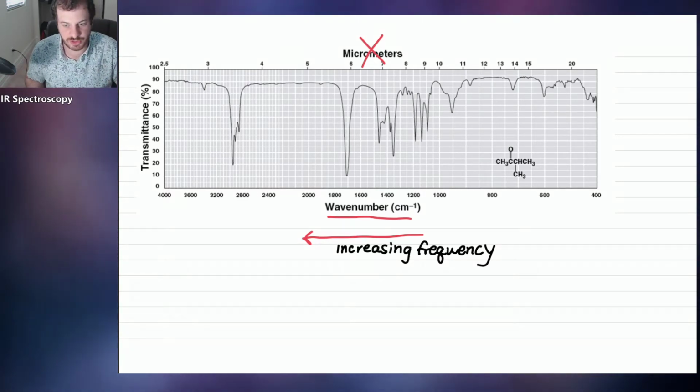Well, before we talk about interpreting this figure, I want to show you one other hint that's going to help us to solve problems, because pretty soon I'm going to give you an IR spectrum and a bunch of compounds, and you're going to have to pick which one matches the spectrum. Sounds impossible, but I promise you it's a lot like being a detective. It's pretty fun. Okay, but before we get into that, I want to mention one more thing, which is the degrees of unsaturation.